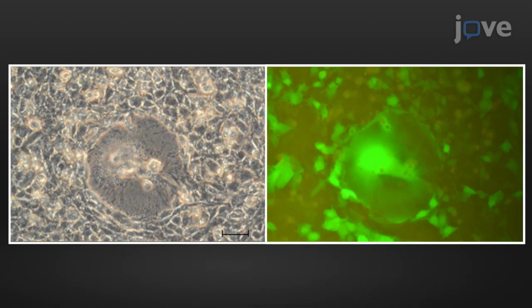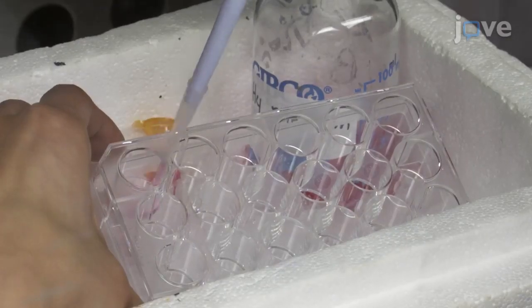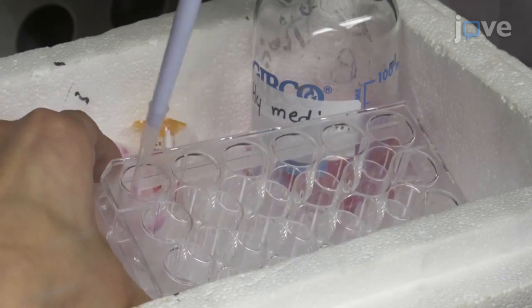Someone performing this technique for the first time should keep in mind that plating of the HC11 cells is important. This is because cell-to-cell contact is important for differentiation. Another point to watch out for is that proper extraction of the EpH4 cells from the matrix is critical for protein quantitation because any residues will affect protein determination. Visual demonstration of this method is useful because some details of the protocol are difficult to describe on paper.